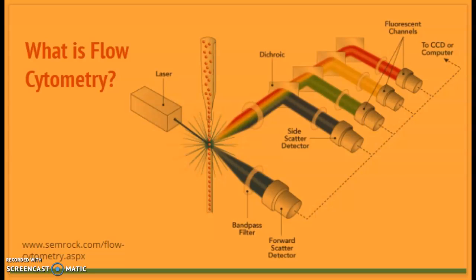Fluorescence refers to light emitted from chemical compounds called fluorescent markers, and it's used to detect cellular molecules such as proteins, nucleic acids, and other things like that that are expressed in the cell. They're designed to absorb light energy at one wavelength, and then they actually re-emit it at a longer wavelength. Samples of cells are prepared by transfection, which is the infusion of the cell with nucleic acids, or the use of fluorescent proteins, dyes, or fluorescently conjugated antibodies.